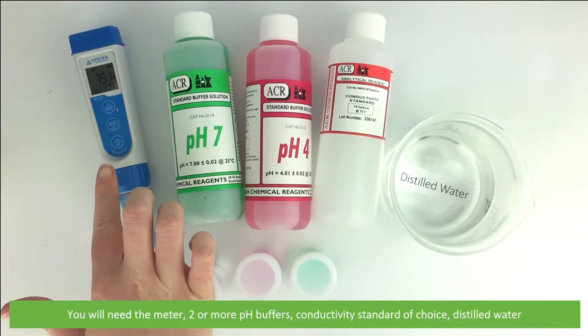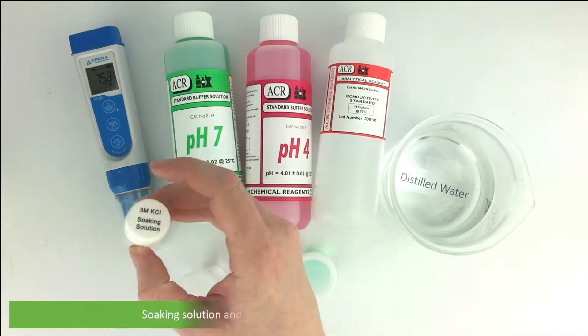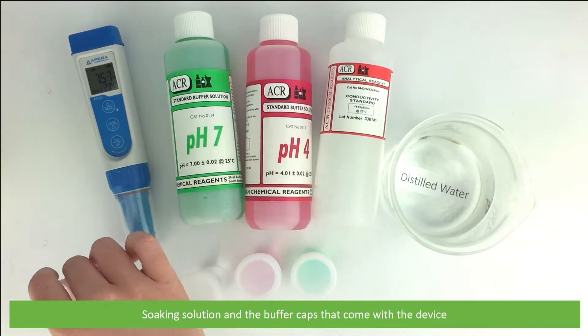You'll need the meter, two or more pH buffers, a conductivity standard of choice, distilled water, soaking solution, and the buffer caps that come with the device.